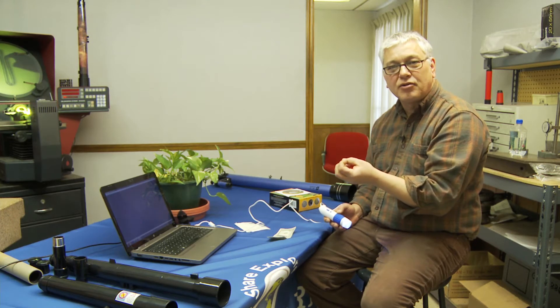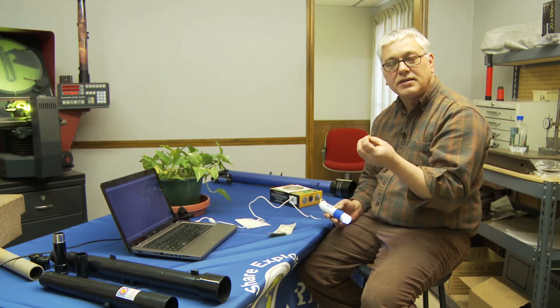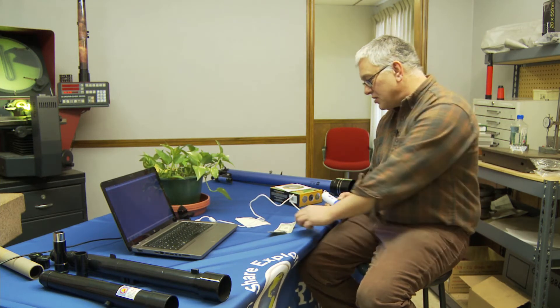They can really inspect their goods. They can authenticate things. It's just a perfect tool for that. And then on the more scientific end, we can take it up to 200 times, which really is getting close to cell level. And we do sell another product, the Microgueur 500, which actually gets us there. But it's basically for educational use.